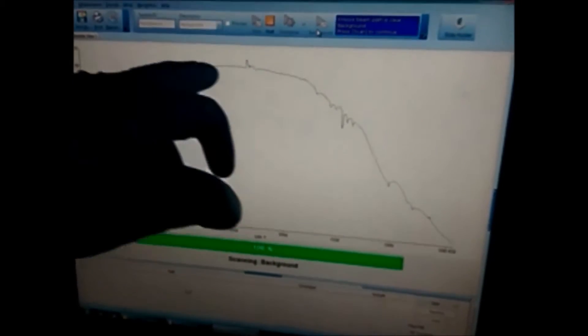So here you see is the background, and these peaks will get cancelled from the FTIRs we're going to conduct.